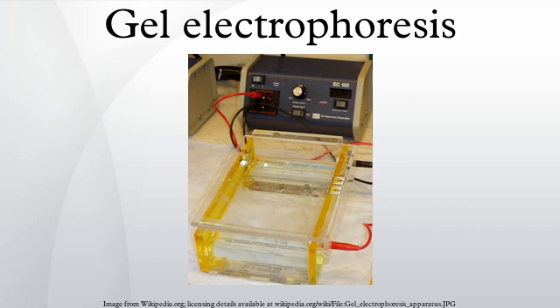Agarose gels do not have a uniform pore size, but are optimal for electrophoresis of proteins that are larger than 200 kDa. Agarose gel electrophoresis can also be used for the separation of DNA fragments ranging from 50 base pairs to several megabases, the largest of which requires specialized apparatus. The distance between DNA bands of different lengths is influenced by the percent agarose in the gel, with higher percentages requiring longer run times, sometimes days. Instead, high percentage agarose gels should be run with a pulsed field electrophoresis, or field inversion electrophoresis.